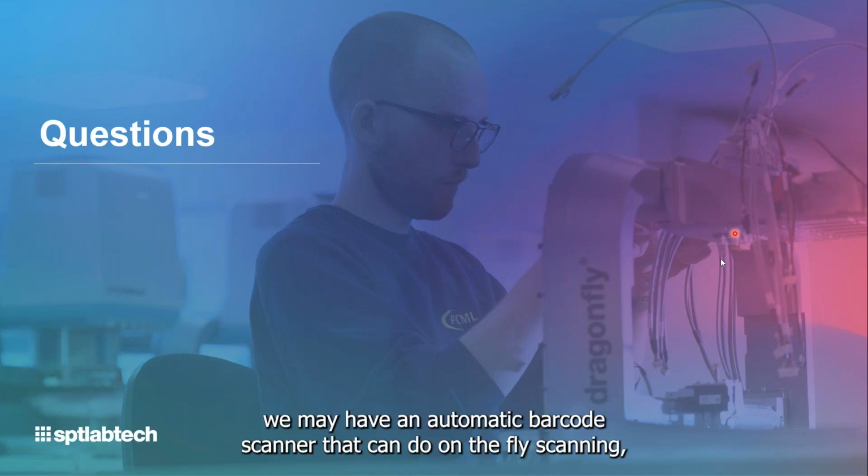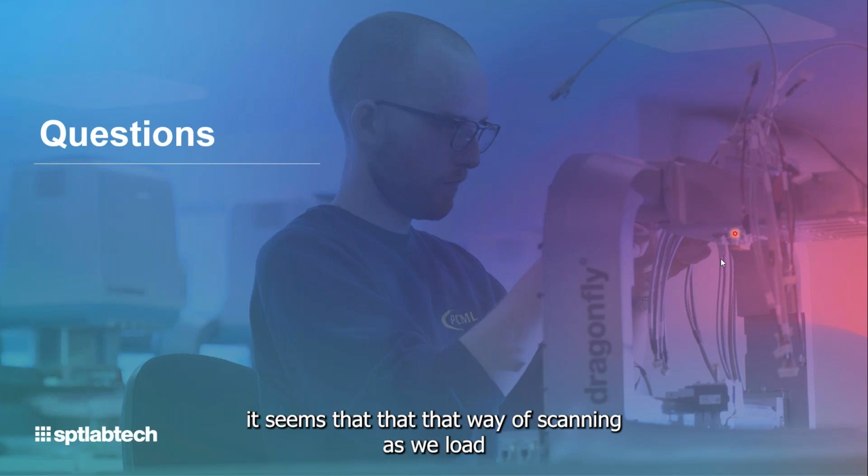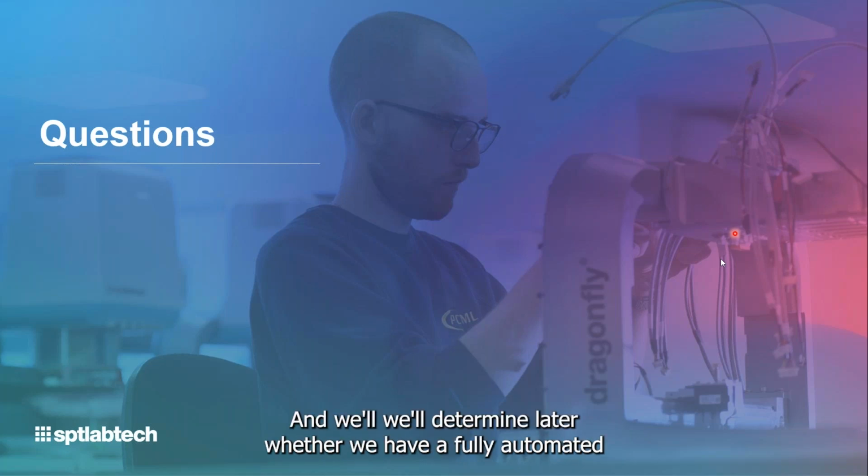Longer term, we may add an automatic barcode scanner that can do on-the-fly scanning, but in working with beta partners, it seems that scanning as you load is quite a popular way of doing it. So that's available as of now, and we'll determine later whether we add the fully automated scanning option.